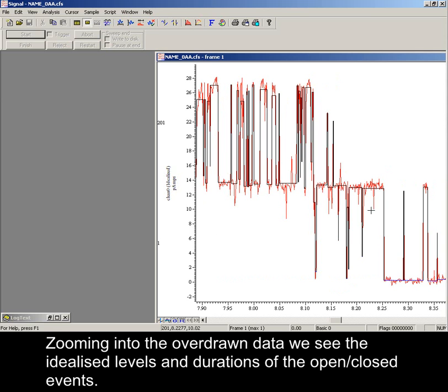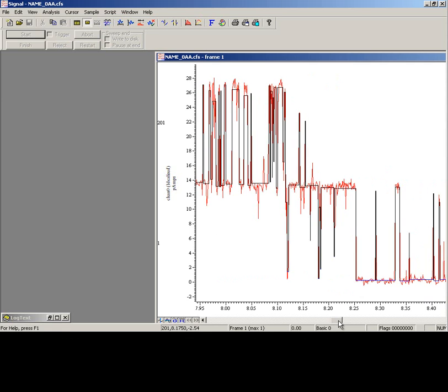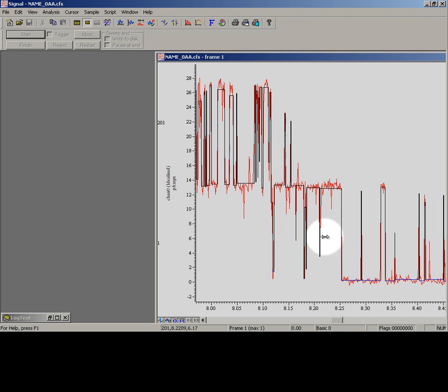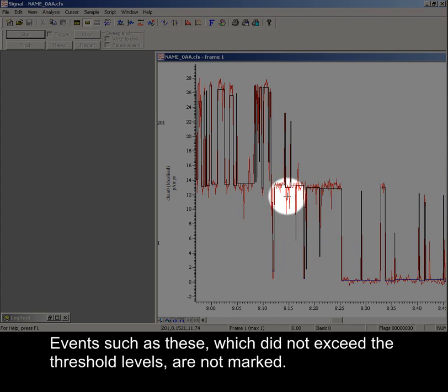Zooming into the overdrawn data, we see the idealized levels and durations of the open-closed events. Events such as these, which did not exceed the threshold levels, are not marked.